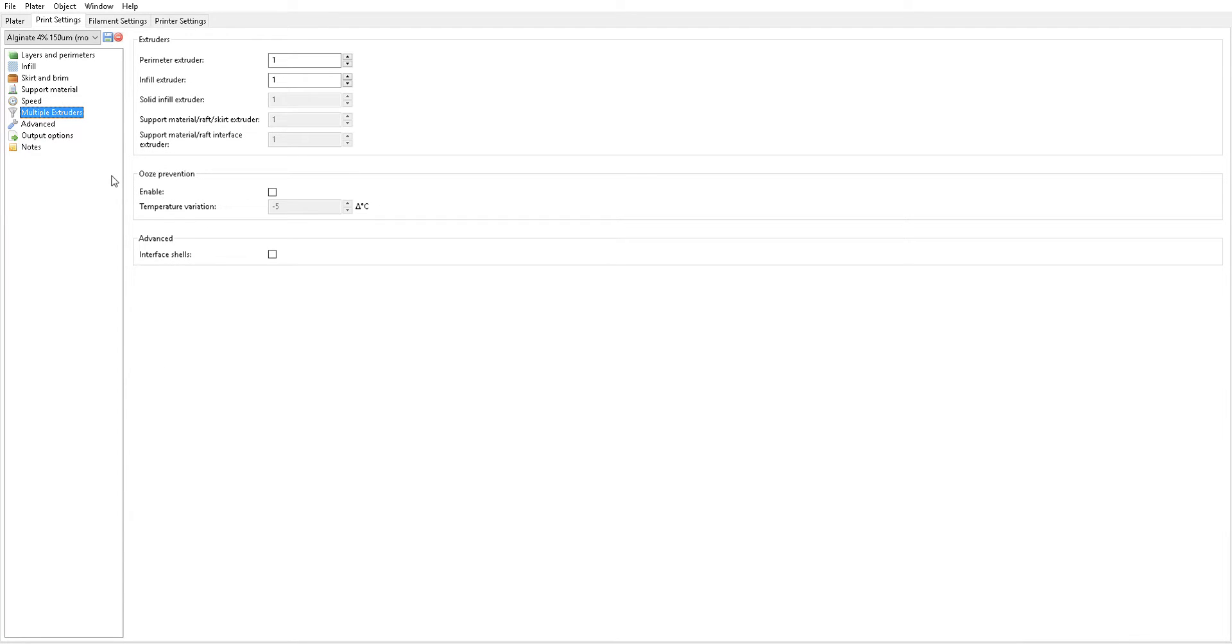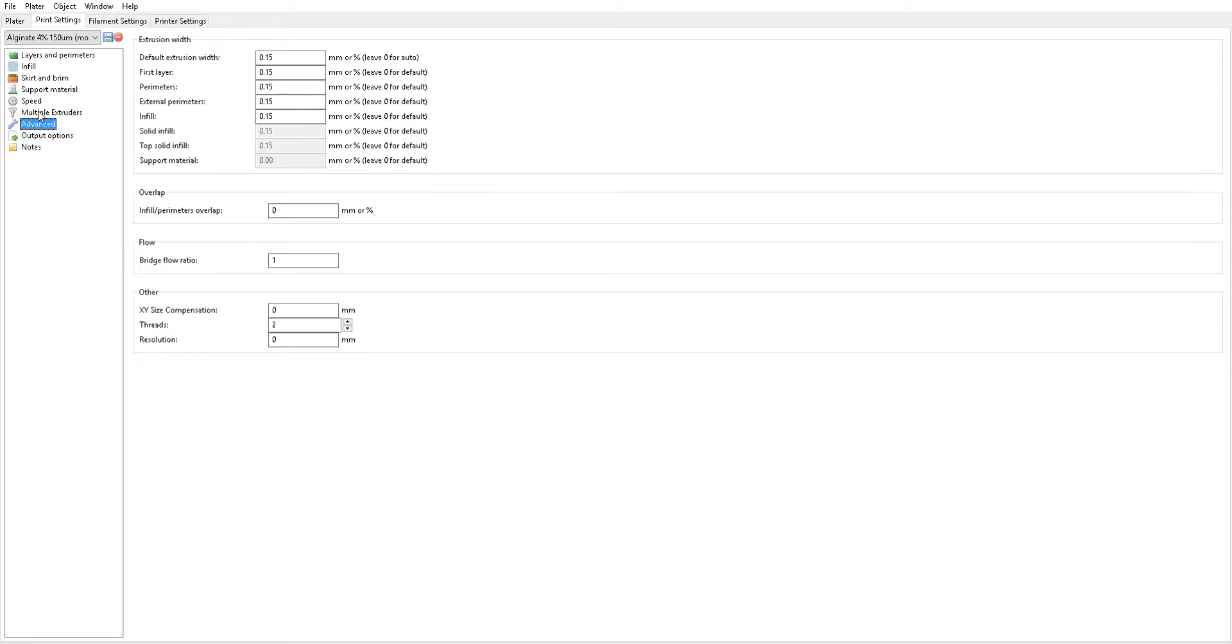Multiple extruders. I wouldn't recommend using any more than one extruder unless you've absolutely mastered single extruder printing, so trying to keep all this to one. You have to crawl before you can run. So try not to overdo it by trying to do multiple extrusion prints before you've mastered the first one.